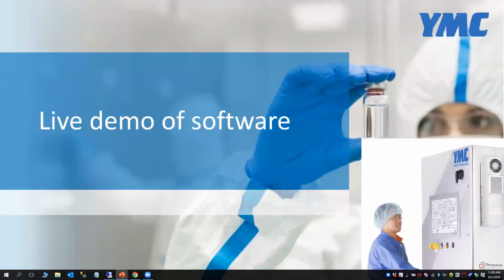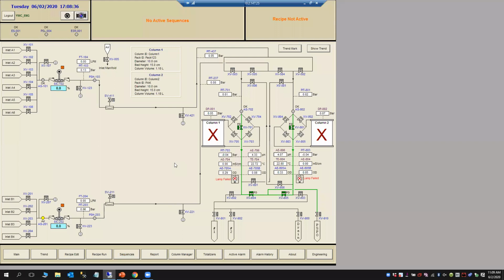So at this point, we will continue discussion over the recipes by showing you the demonstration of one of our live standard systems, which you can currently see on the screen.